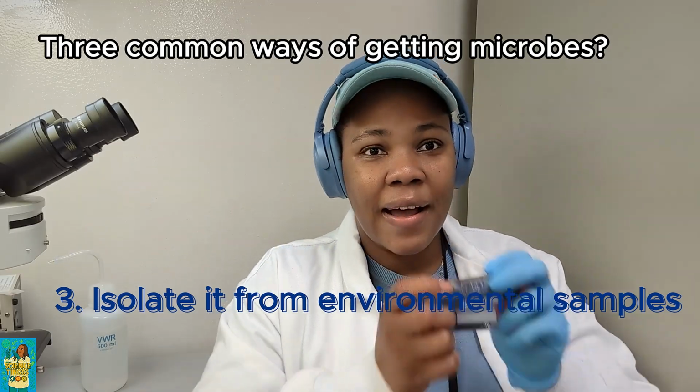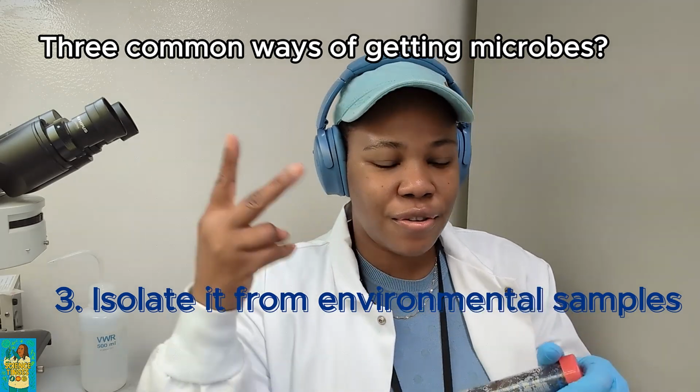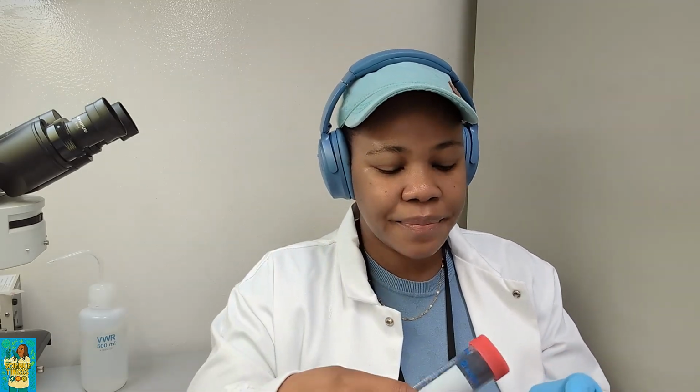So I am isolating it from the soil. Why not go to the usual other two, or the first one where we buy it? I am working on something and I'm just curious to see if I can get it, seeing that that's not the main one we're working with.